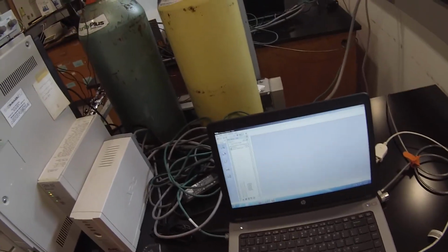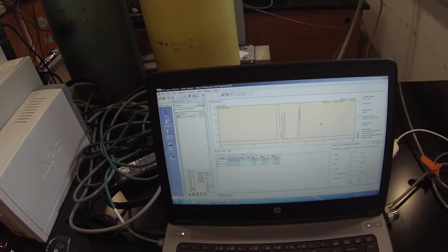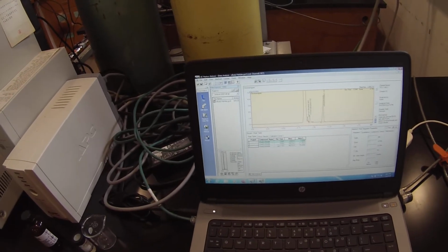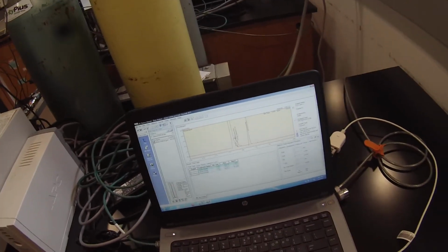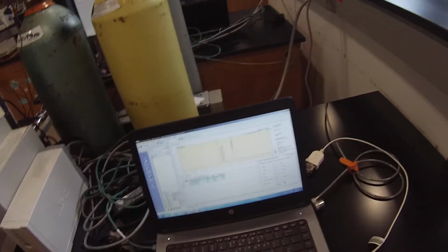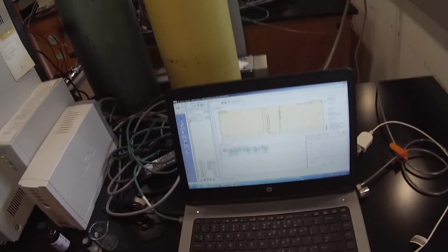But I'm going to go to post-run. I'm going to open up my n-butyl halides chromatogram. And it looks like n-butyl bromide should come off at about 1.15 minutes, right? So that big peak was the n-butyl bromide, and this early peak at 0.932 was the n-butyl chloride. I suspect that this peak at 0.899 is in fact not n-butyl chloride. That's almost certainly a residual solvent peak, and it may be because the n-hexane has a little contamination with methyl cyclopentane. But I can get it to not integrate that so that I don't see that peak that I don't want.